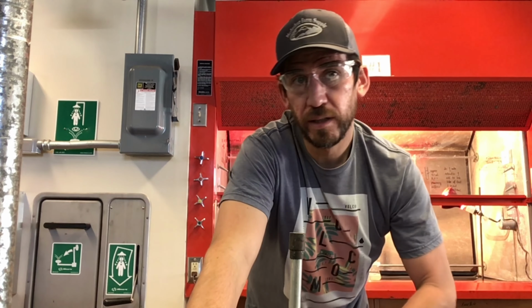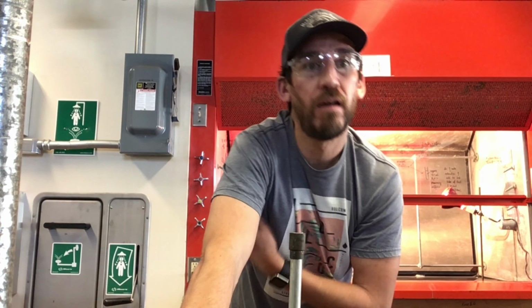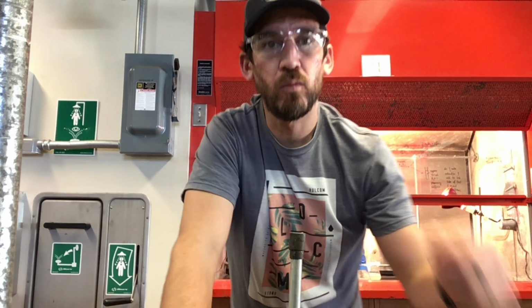So I'm going to show you what a positive result looks like, and I'm going to show you what a negative result looks like. So let's take a look. We're going to look at bromobenzene for our positive, a compound with a halide. Then we're going to look at benzoic acid, one without. Okay. All right, let's go.